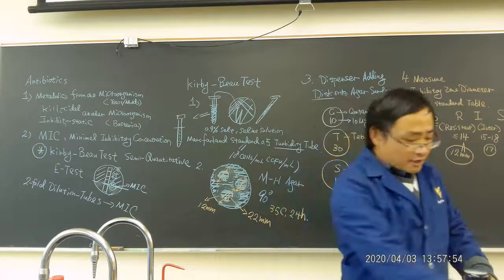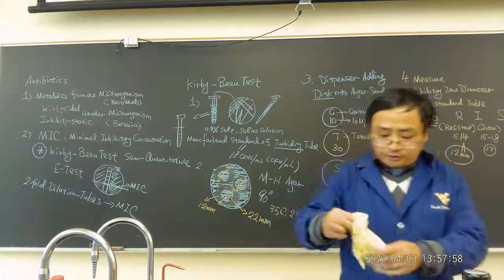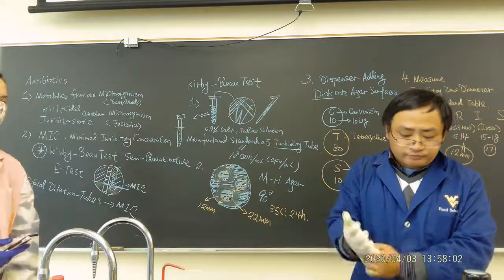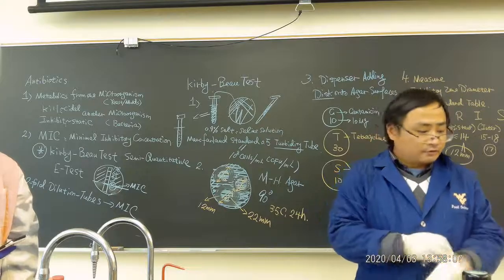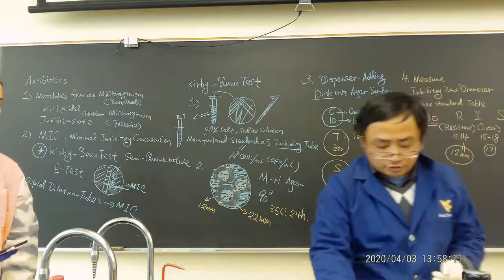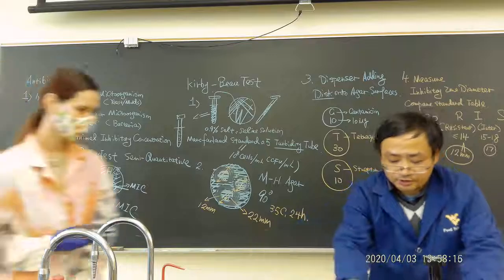Now let's do a demo for you. So Karen here, I'll show you how to do it, and I want some of you to come here to do some of the tests. I will let you. Some of you, if you're interested, you can do it. So first of all, you can come here and take a picture of this.